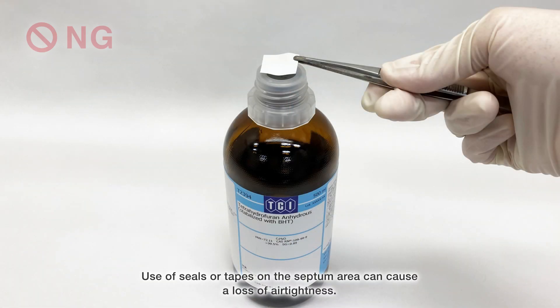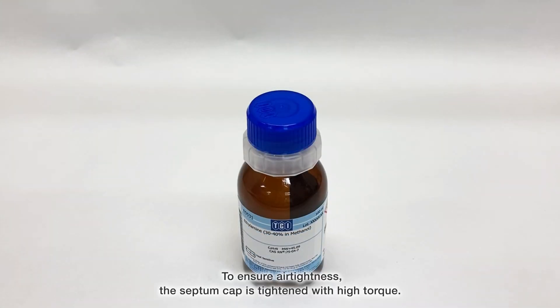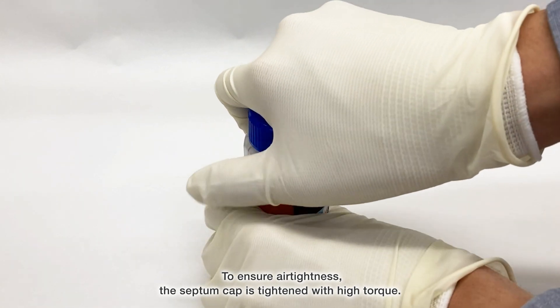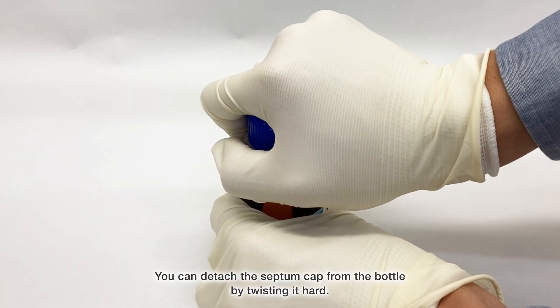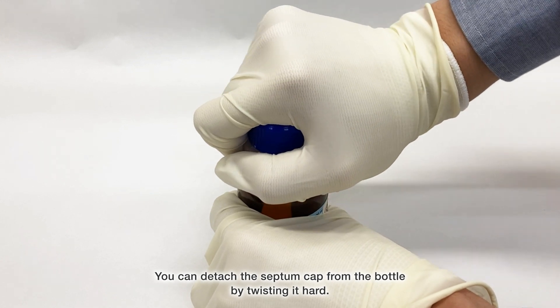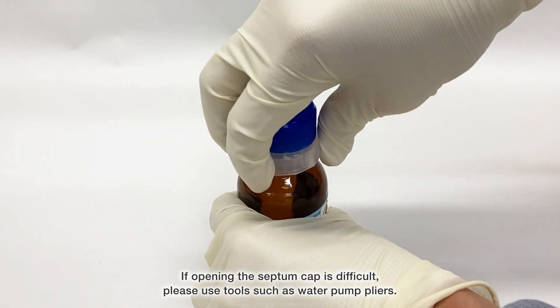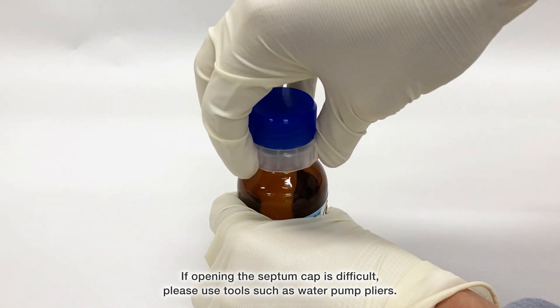Use of seals or tapes on the septum area can cause a loss of air tightness. To ensure air tightness, the septum cap is tightened with high torque. You can detach the septum cap from the bottle by twisting it hard. If opening the septum cap is difficult, please use tools such as water pump pliers.